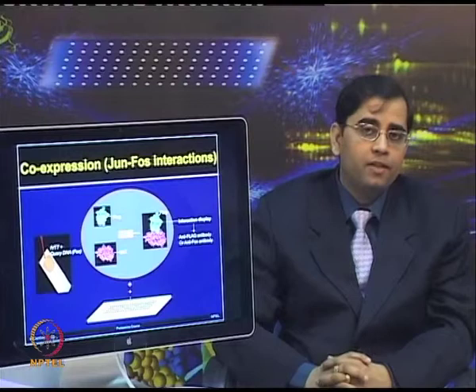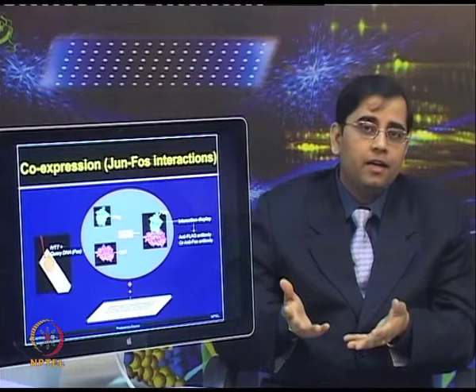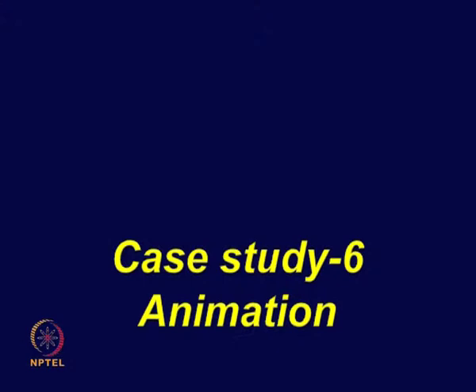So, by performing this type of approach, the authors allowed co-expression, which means the same environment for both query and target proteins. Both proteins are expressed in the same mammalian environment and there is a good likelihood that they are going to identify the right interactors. So, let me show you the steps involved in the study by showing you this animation.